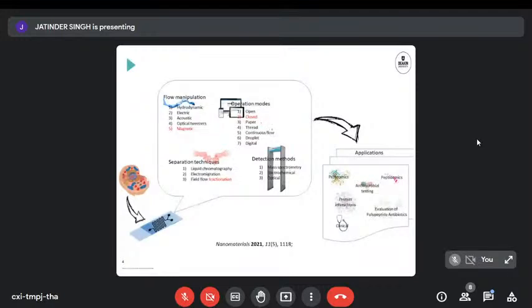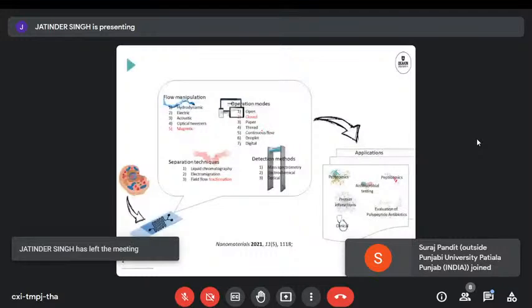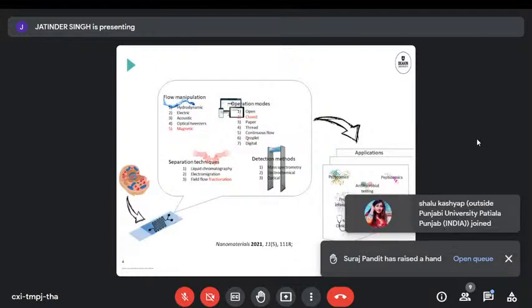We've got continuous flow separations. Think back about the free flow electrophoresis that we visited. Droplets, where we get segmented flow. And there's digital microfluidics, which is an area where I thought we were getting too broad if we would get into there as well. But digital microfluidics, we've seen digital PCR. It is doing everything on separate droplets. Again, it can be done in microchannels or it can be done on surfaces.